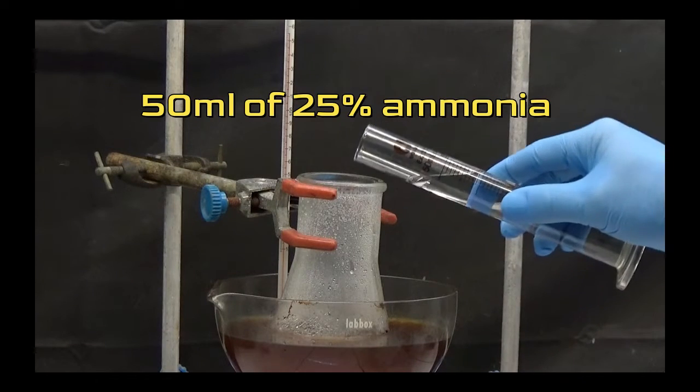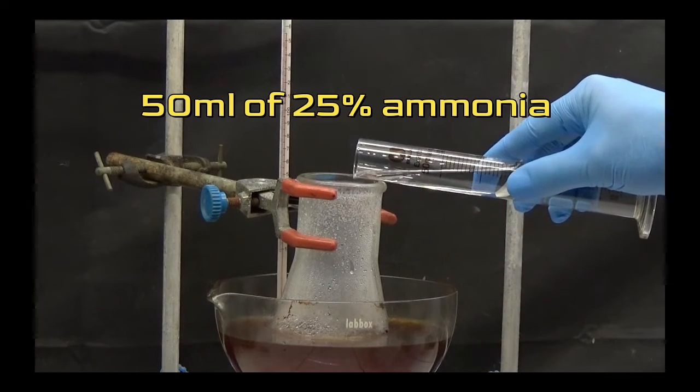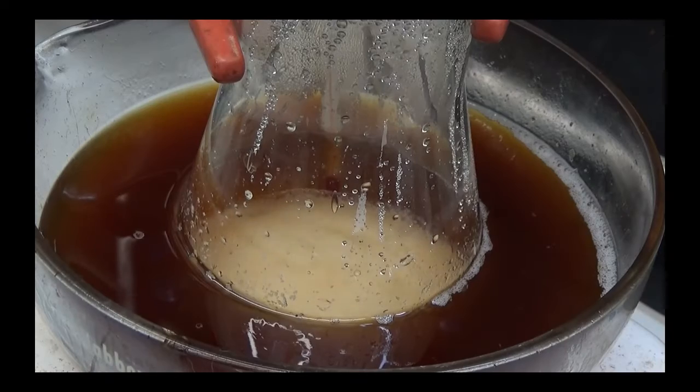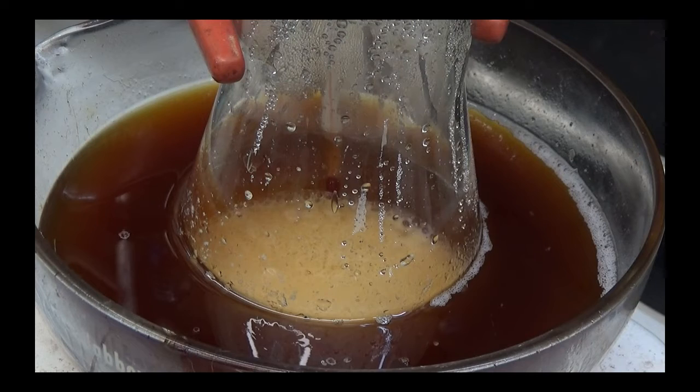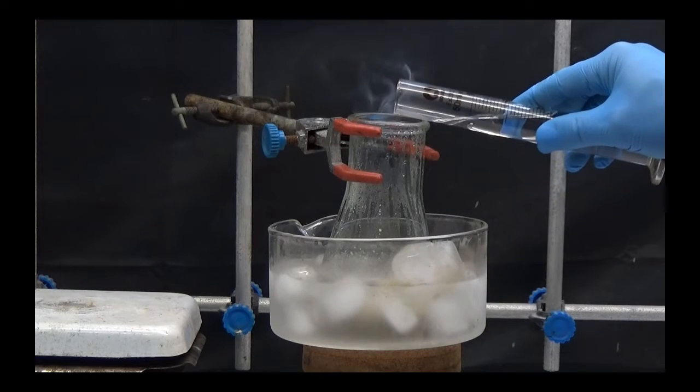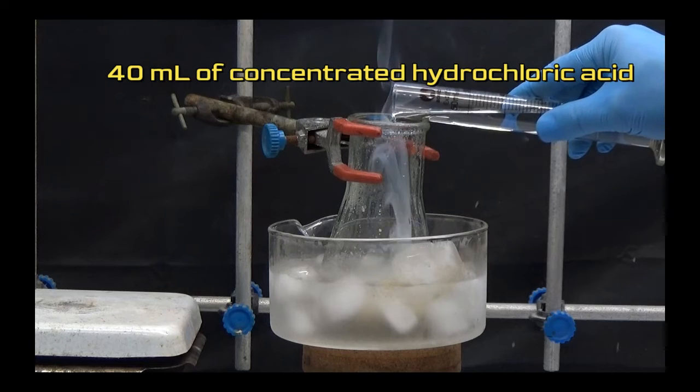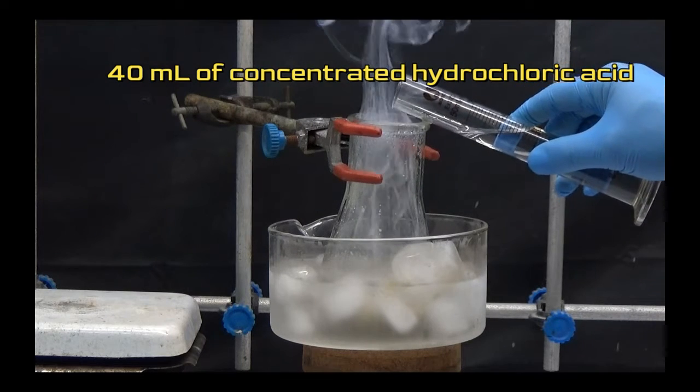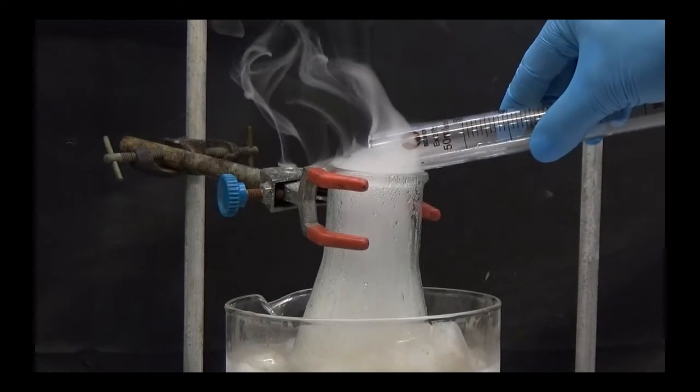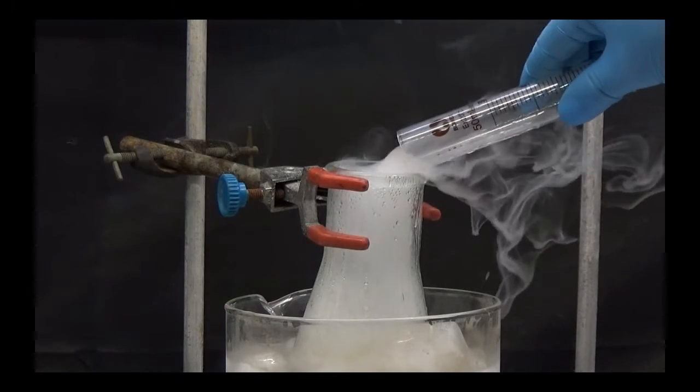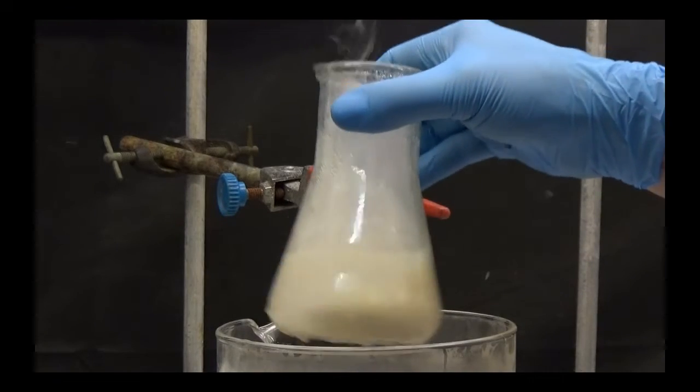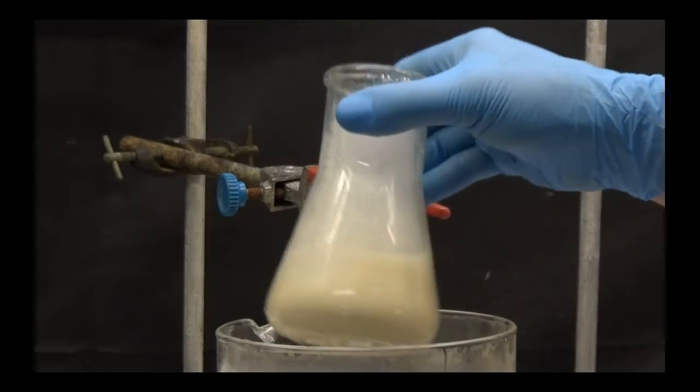After 2 hours have gone by, carefully add 50ml of 25% ammonia in 10ml portions. Bring to a boil for a total of 10 minutes. Cool with an ice bath and add 40ml of concentrated hydrochloric acid. A white precipitate is formed. Collect the precipitate by suction.